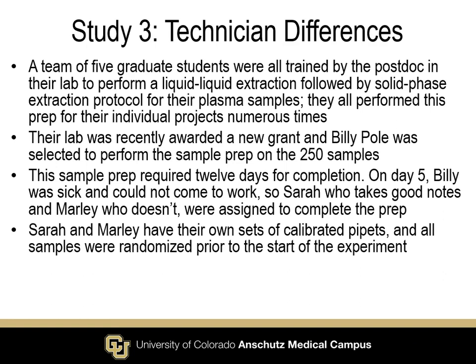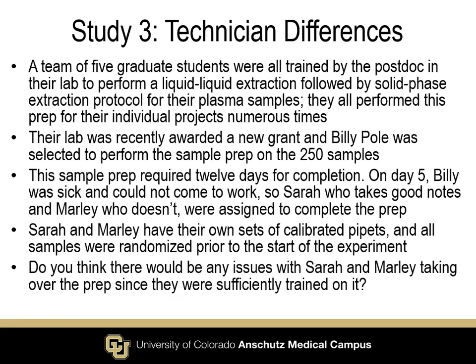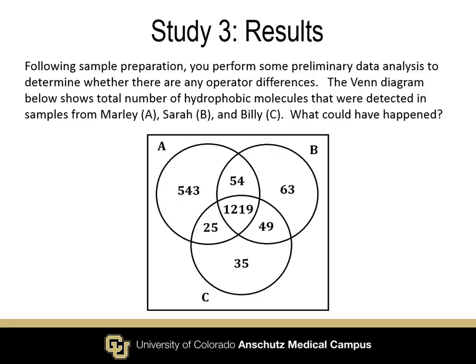So both of them have their sets of calibrated pipettes, and all the samples were randomized so that there would be minimal, I guess, differences between the two. But I see some issues. Does anyone else see any issues with the two new experimenters that are going to finish this prep? Anyone? No? Okay.